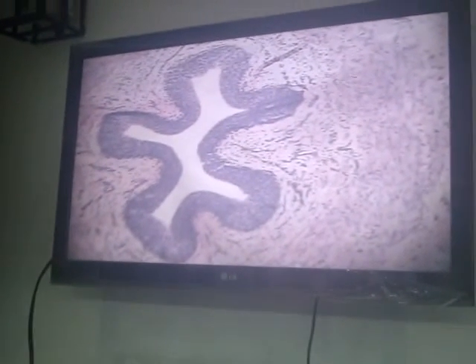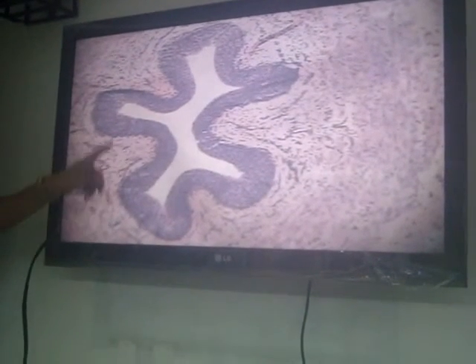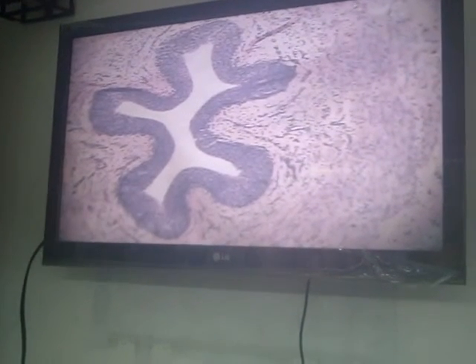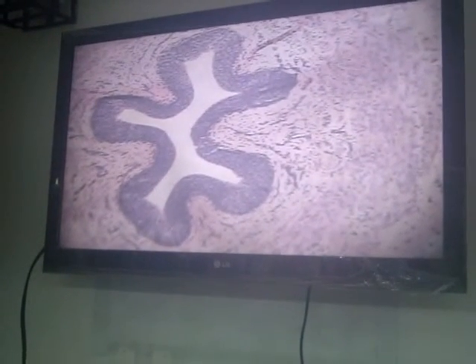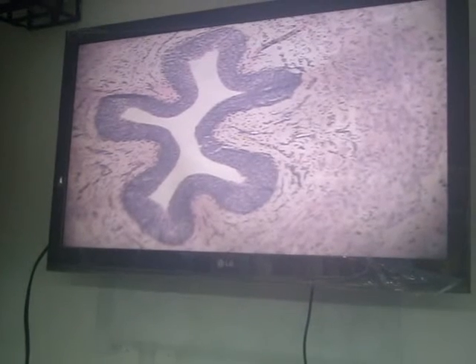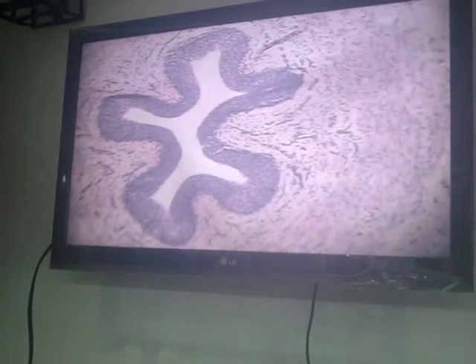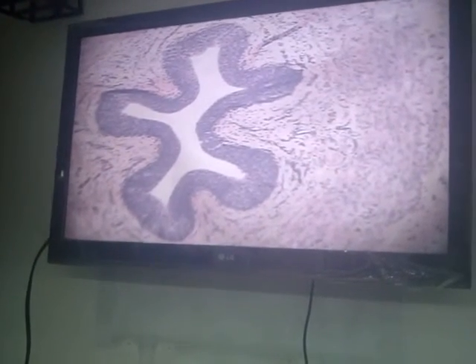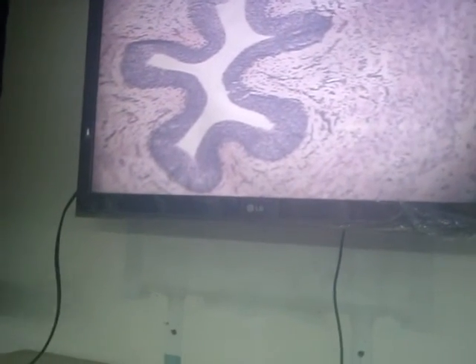For our transitional, this is the ureter, class, ureter. Transitional. So in other slide boxes, you can have the urinary bladder. That's also transitional epithelium. Urinary bladder, ureter. Then for our stratified squamous keratinized, skin, and for your non-keratinized, esophagus.